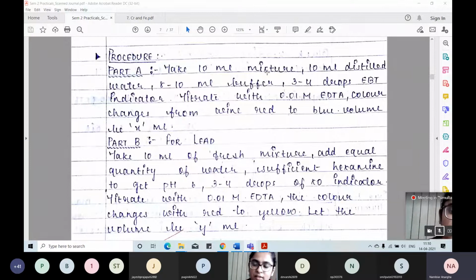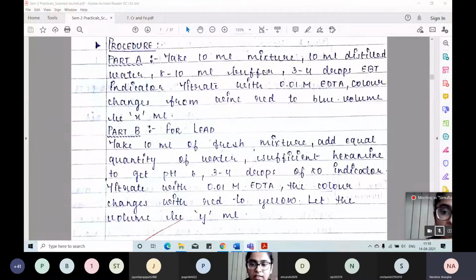In that you can bind your EDTA exclusively with lead, and the remaining things are just the same. अगर एक बार आपको पता चल जाए कि मैग्नीशियम लेड के लिए इतना ml यूज होता है एंड एक्सक्लूसिवली फॉर लेड यू हैव डिफरेंट वैल्यू, just subtract it and you will come to know how much ये was for your magnesium.